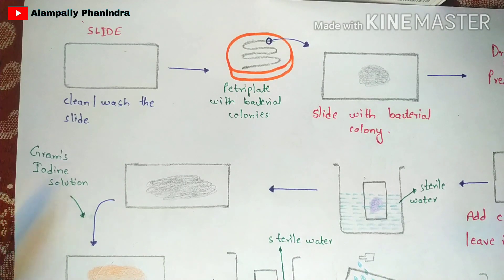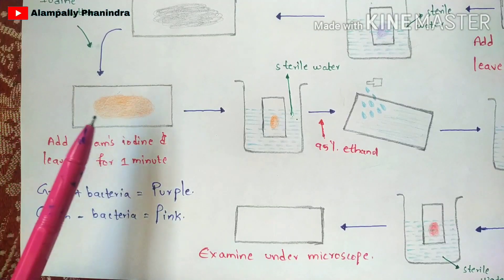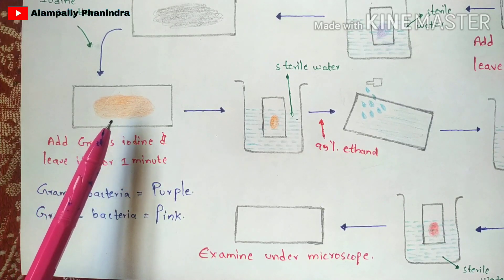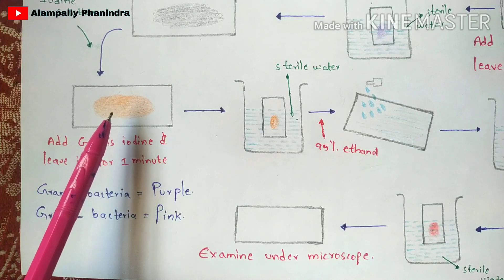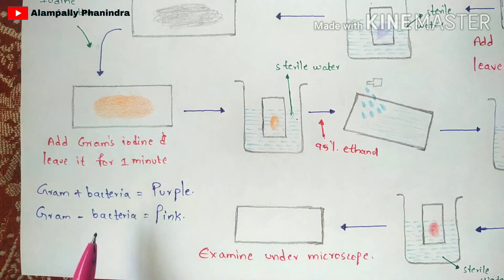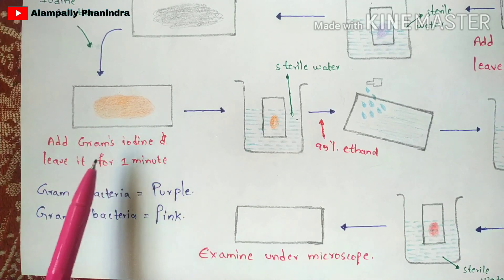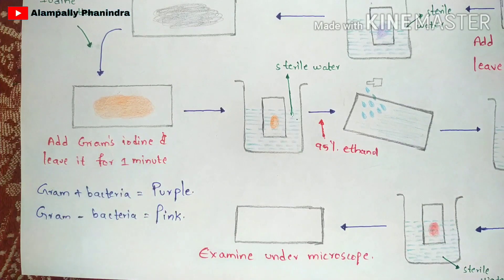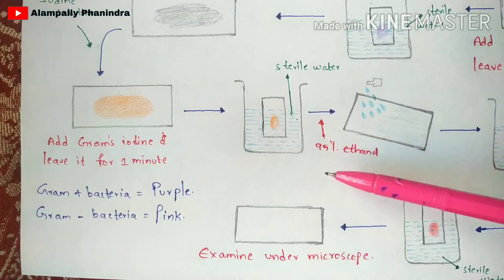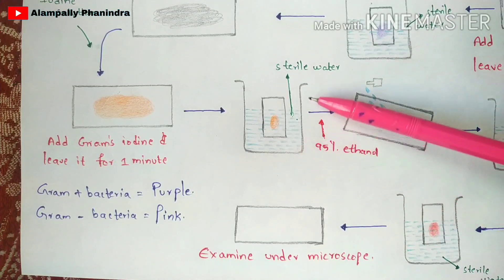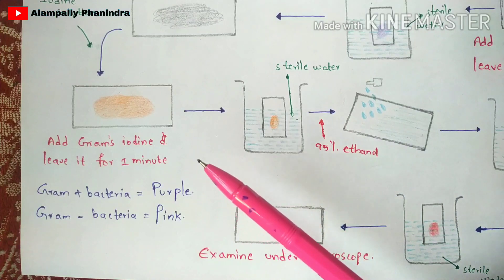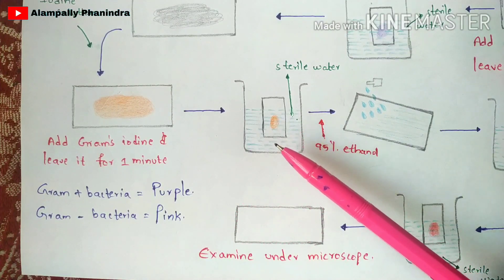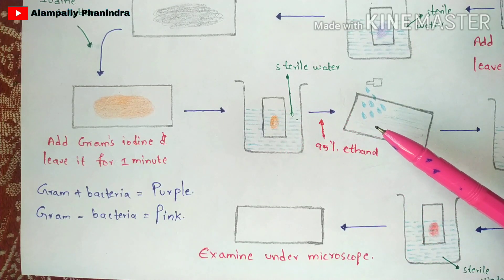Next, add gram's iodine solution to the slide — gram's iodine has a slightly orange color. Add it onto the slide containing the bacterial colony and leave it for one minute. After one minute, take a water bath with sterile water, dip the slide into it, and wash it. Then remove the slide.